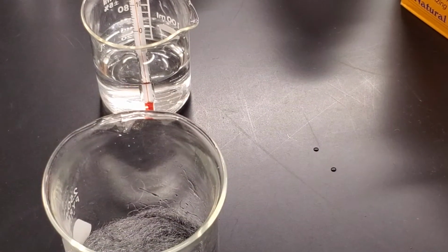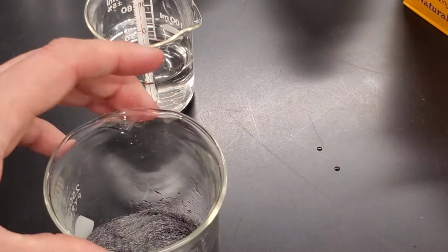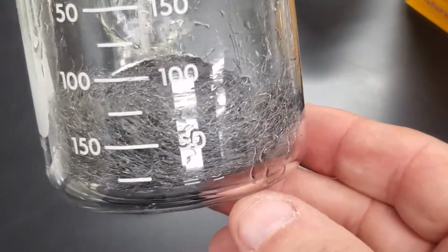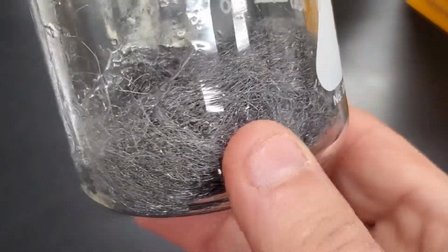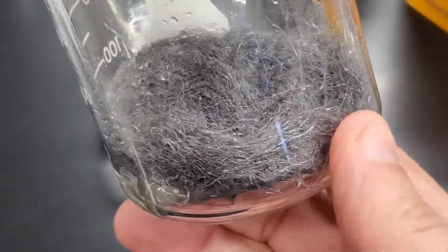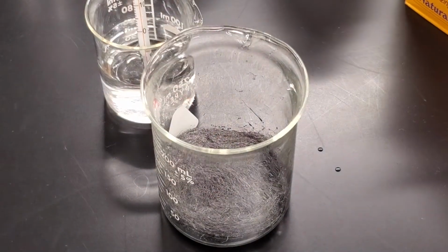And there we go. We are to record any changes or effects or indicators that we might see. So we look at this. Do you see any changes? Any noticeable changes from what you would expect? We are to wait 2 minutes for this reaction to continue to take place, and then we will observe it again and record the temperature.